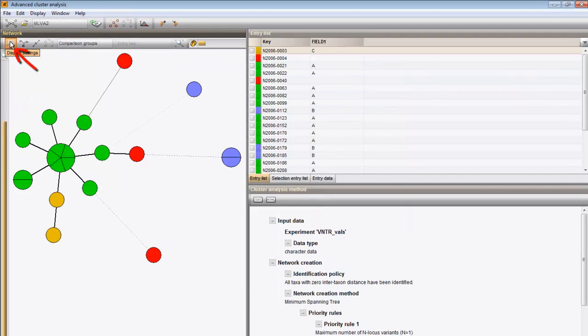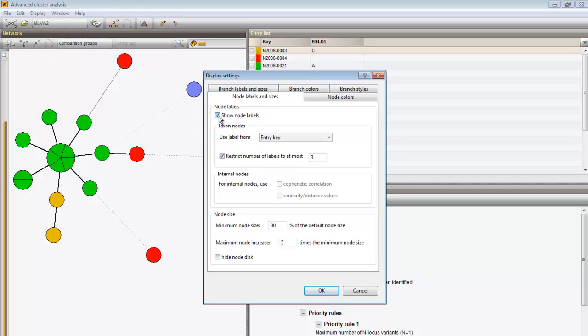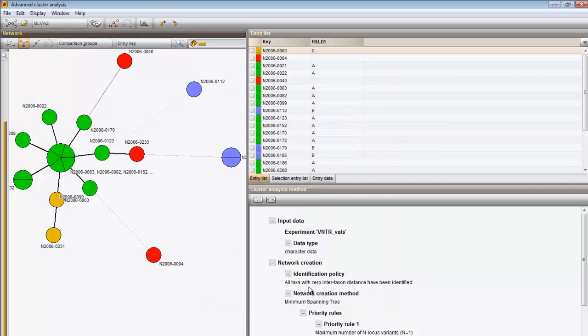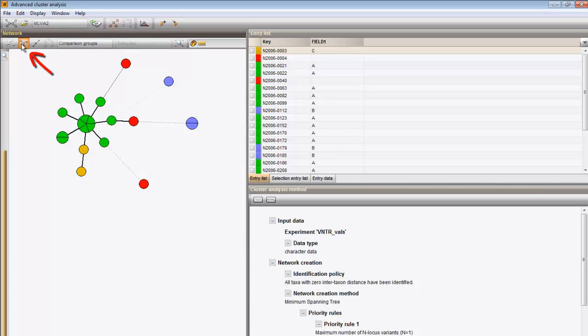Under the button Display settings, you can find a number of options to adjust the looks of the tree. I can, for instance, show the keys next to the nodes. This button will do the same.